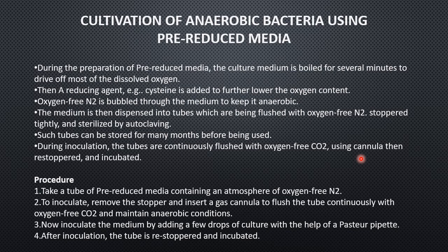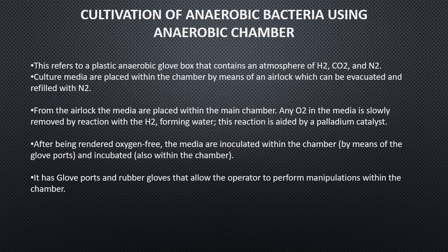So to inoculate, you remove the stopper. Again, you have to insert a gas cannula, flush the tube continuously with oxygen-free carbon dioxide and maintain the anaerobic conditions. So now you inoculate the media and then you can incubate it after restoppering. Okay, just a simple way. But here you have to keep in mind that flushing your media with oxygen-free CO2 and N2 is very important to maintain the anaerobic conditions.